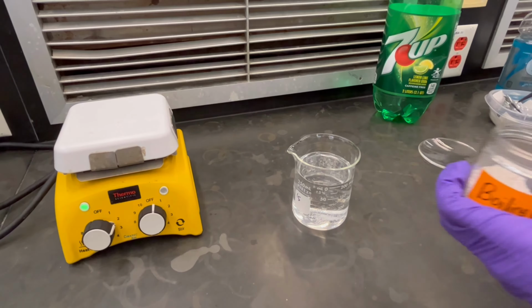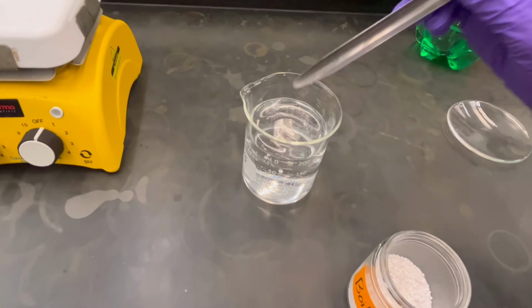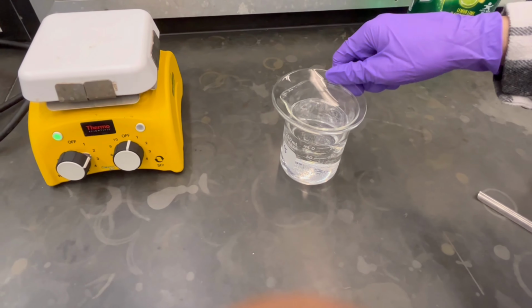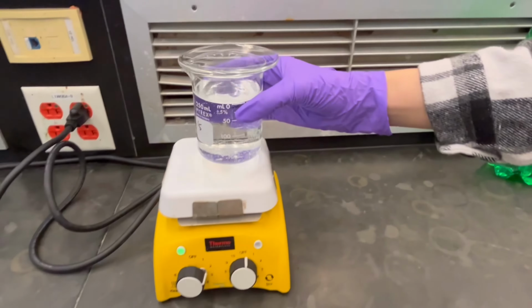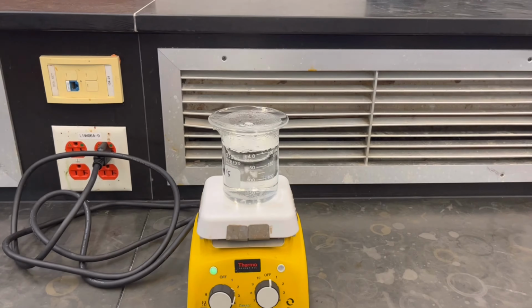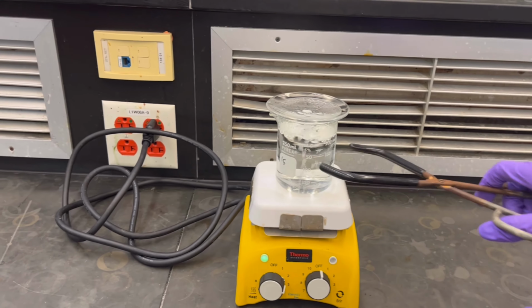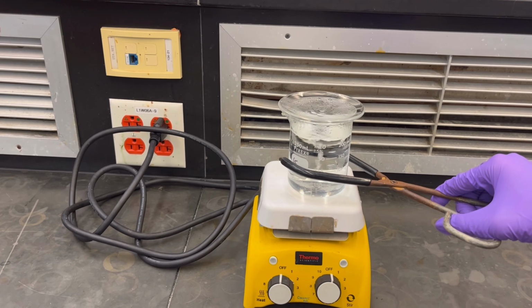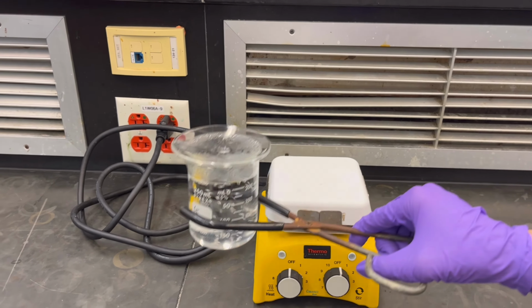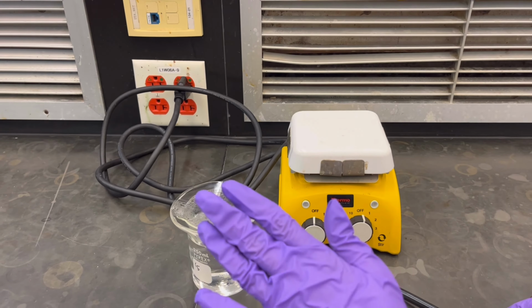Then we will add the boiling chips. We can add 2 to 3 boiling chips. Here I added 3. Then getting our watch glass, we will cover our beaker to minimize evaporation. Then we will place our beaker on the hot plate until it boils. After the soda has boiled, we bring our tongs to remove the beaker. But first, don't forget to turn off your hot plate for it to cool down. And now using the tongs, we're removing our beaker and putting it on the bench so it can cool down for part C.